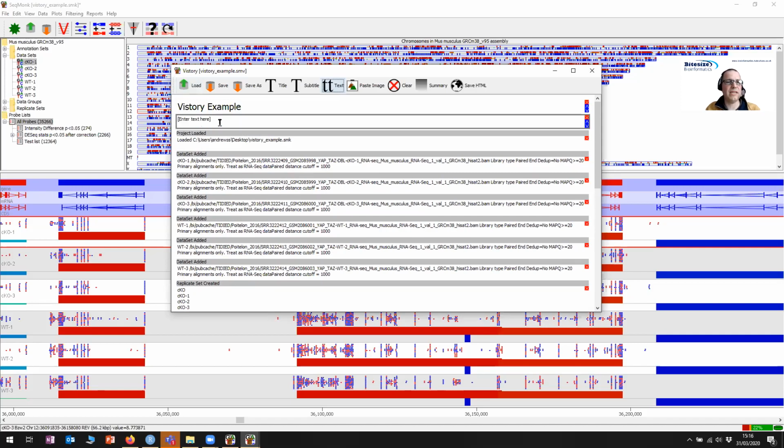I can then put text in. So here I can put any old bit of commentary I want. Okay, and in a real analysis, you would write something generally before and after any particular sort of step that you'd taken to say what you were intending to do, then to do the actual analysis, and then to record what you think you saw when you looked at it.